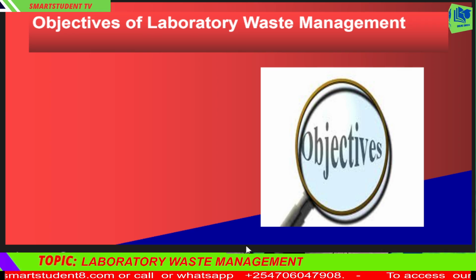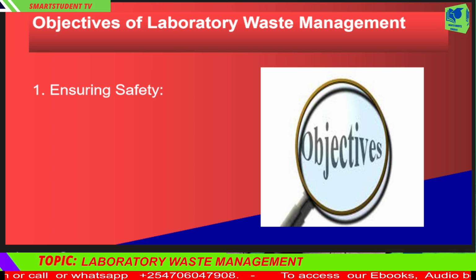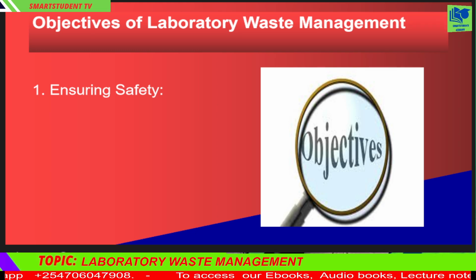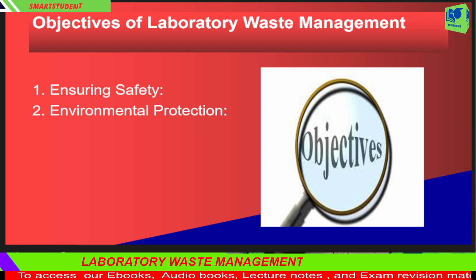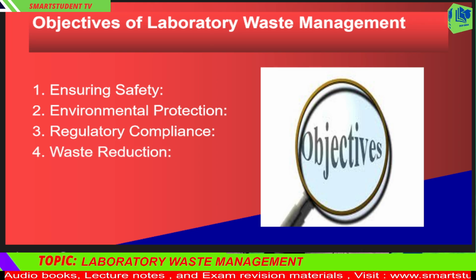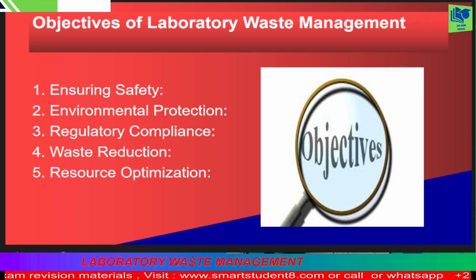These objectives include: 1. Ensuring safety. Protect laboratory personnel, students, and visitors from exposure to hazardous waste materials. 2. Environmental protection. Prevent contamination of soil, water, and air by ensuring proper waste disposal. 3. Regulatory compliance. Adhere to national and international laws and guidelines governing waste management. 4. Waste reduction. Minimize waste generation through efficient laboratory practices. 5. Resource optimization. Promote recycling and reuse of materials where possible.